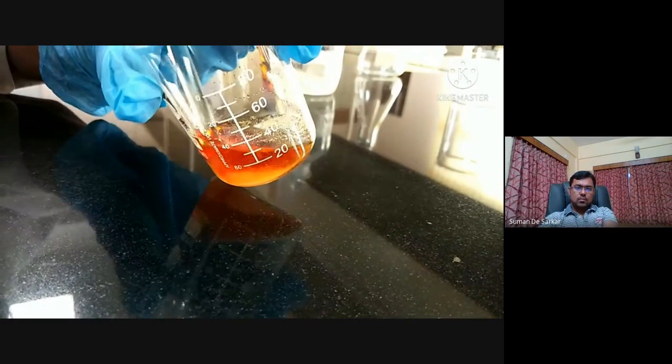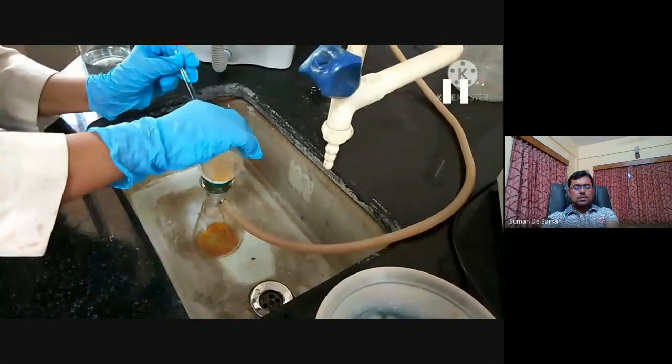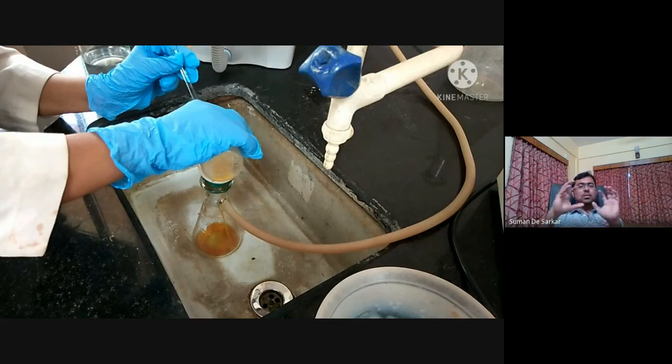Then we go for the filtration. Yeah, this is a characteristic of hydrazones. Most hydrazones, with this scratching, probably increase the local concentration somehow, and then the collision between molecules, and precipitate means the same molecules are coming together and going out of the solvent, right? So normally when something is soluble in solution, it means it's inside a solvent cage, right? So the amount of solvent molecules compared to the substrate is much higher.